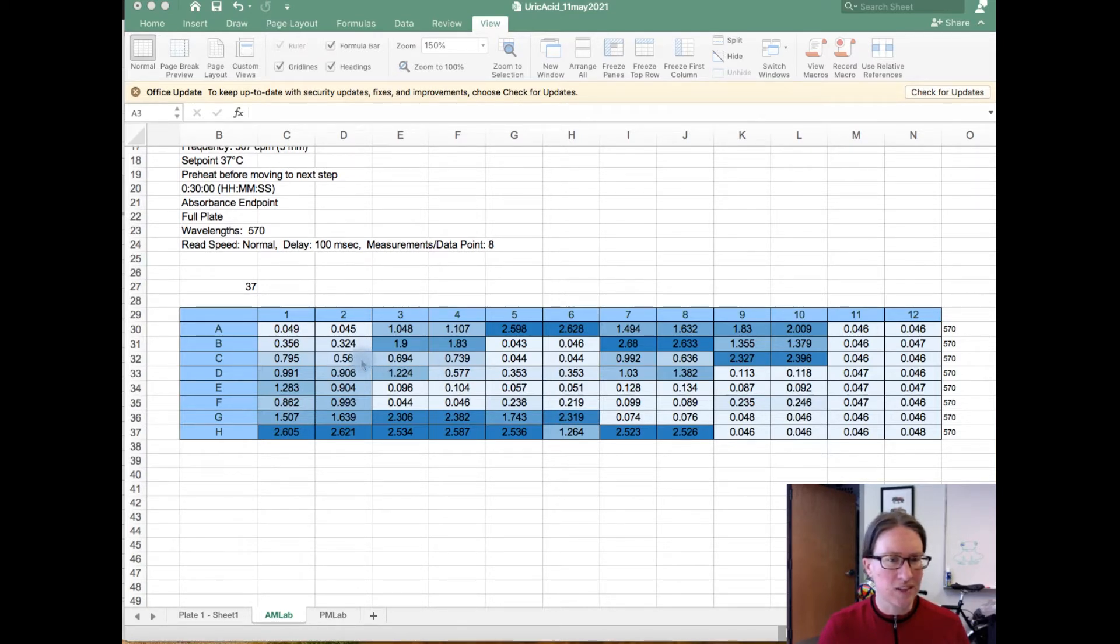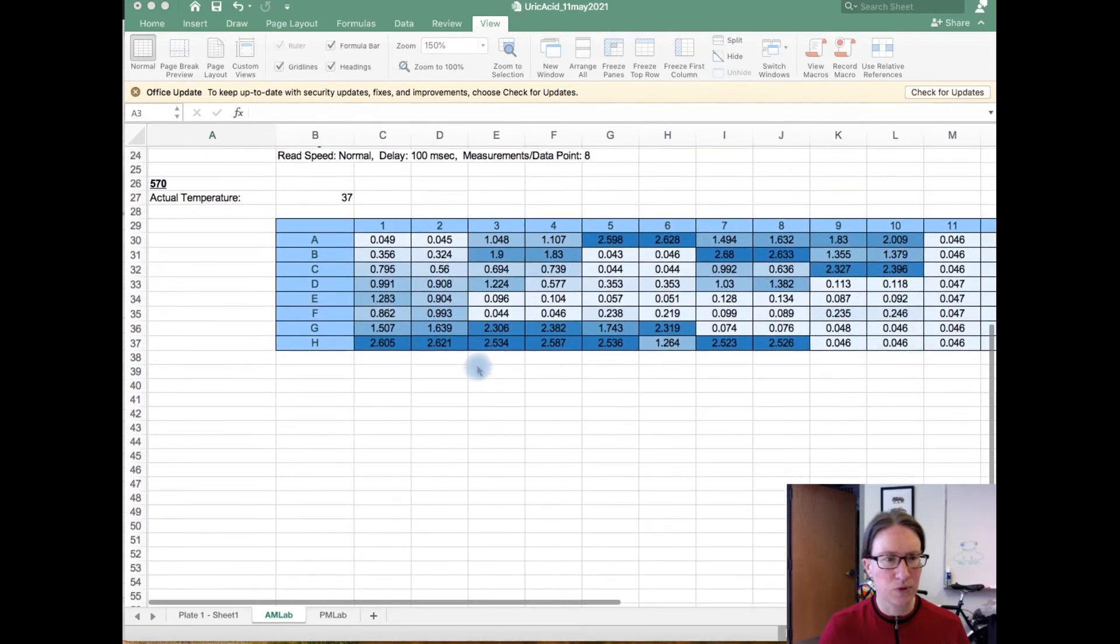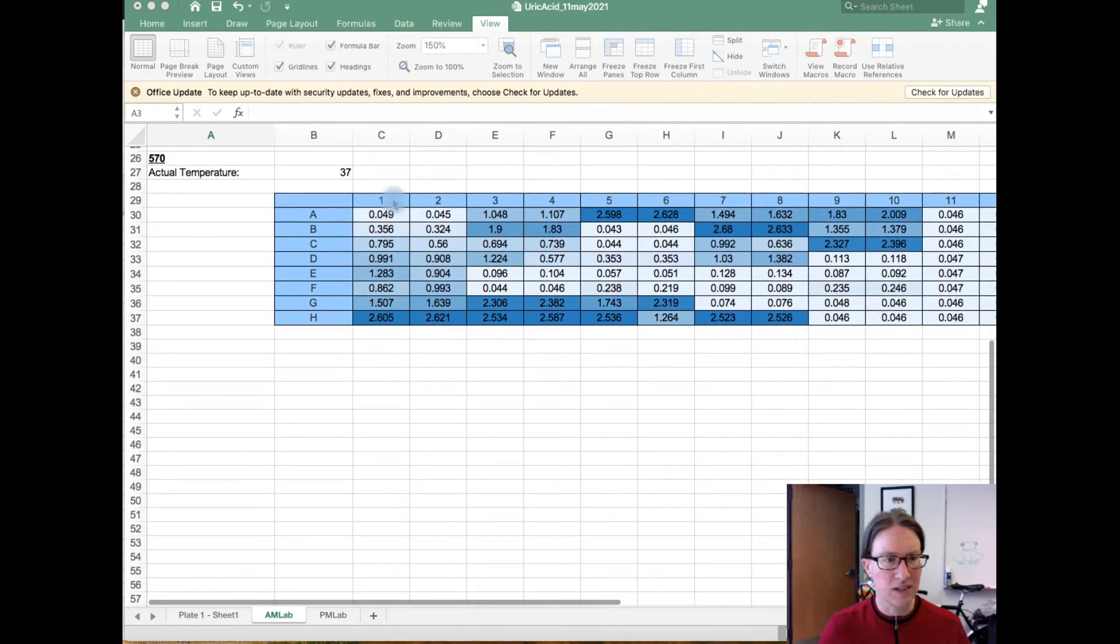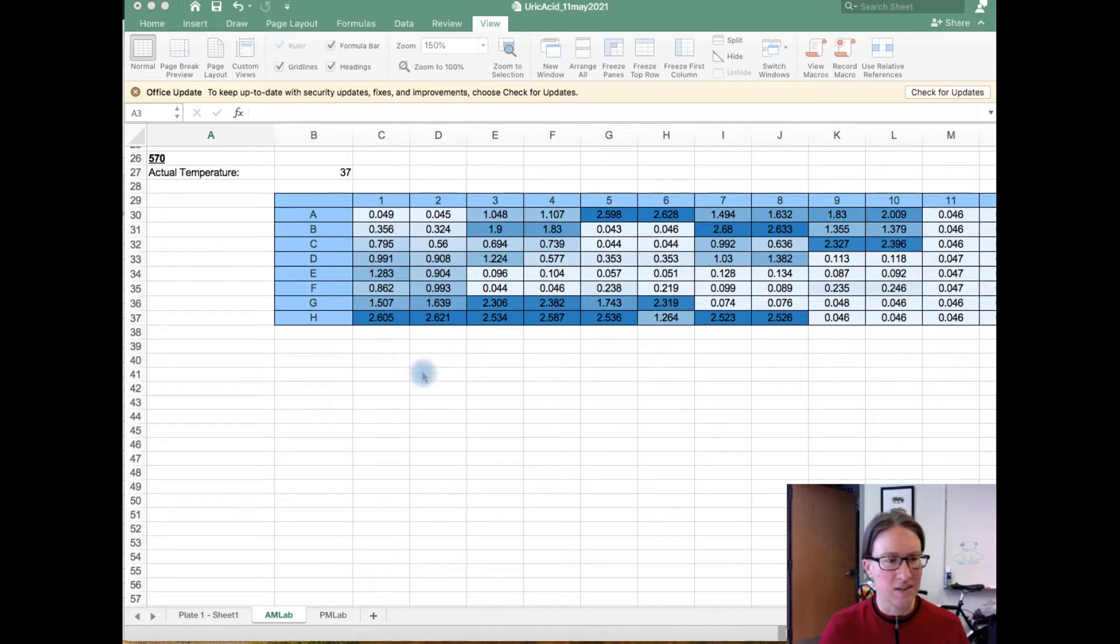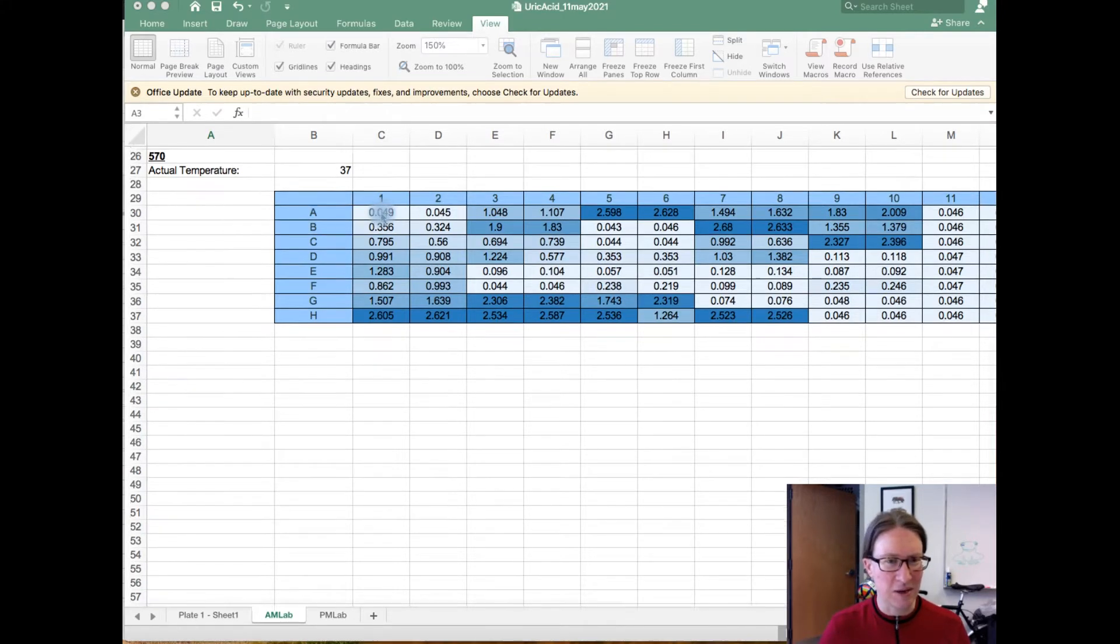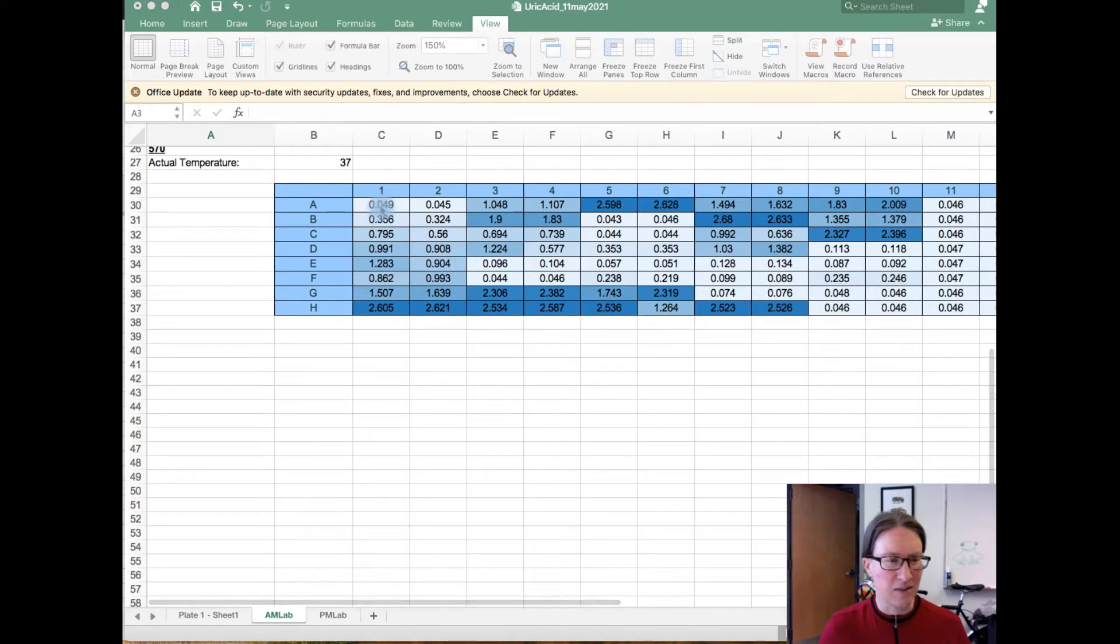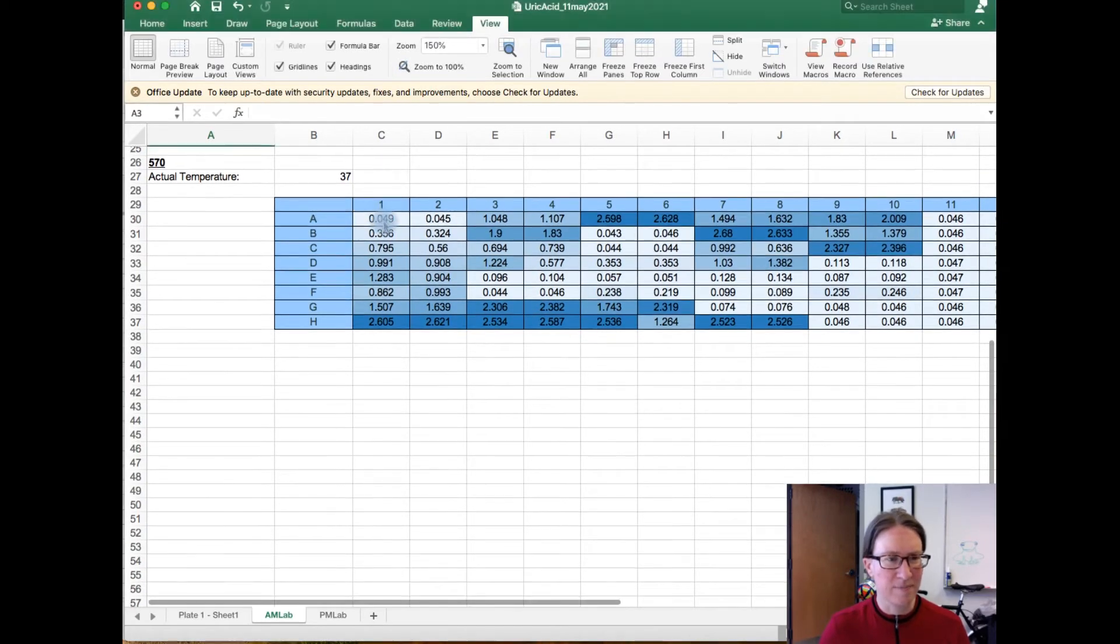So what I generally like to do is, underneath this map, I'm going to pull out the measurements, and I'm going to put the pairs of measurements, because we put each sample into two wells, into a set of columns, and then I'm going to conduct some follow-up calculations with those. So we'll fast forward through a lot of the copying and pasting, and then I'll pick up again with some steps after that.